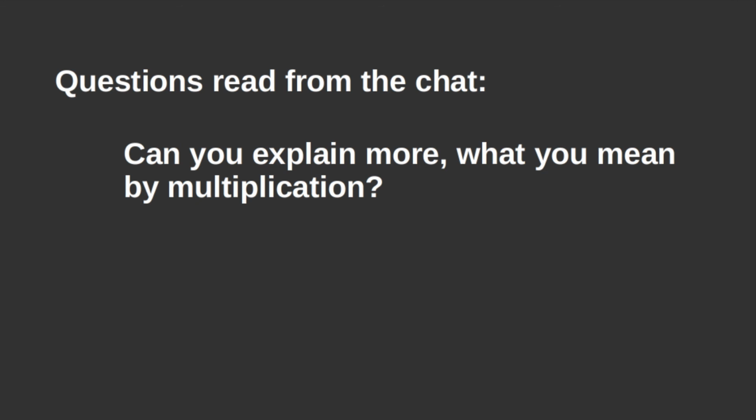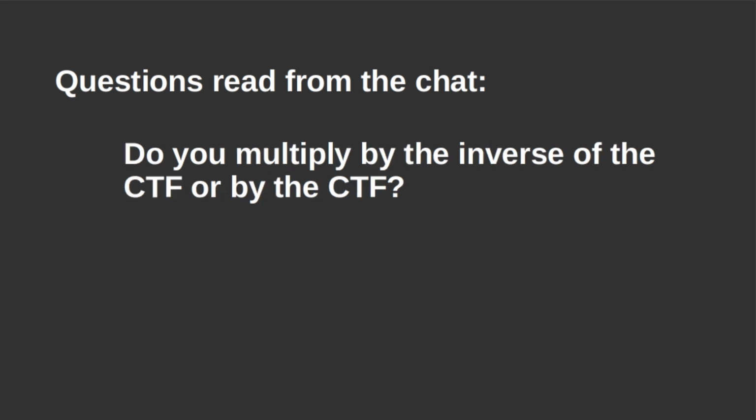Thank you, Beata. In this regard, my question was related to this. Looking at the images, I have the feeling that the multiplication changed the spectra, like a kind of whitening or something like that. So it's because of the boosting of the... It's because of it. It's making things more even and less contrast.